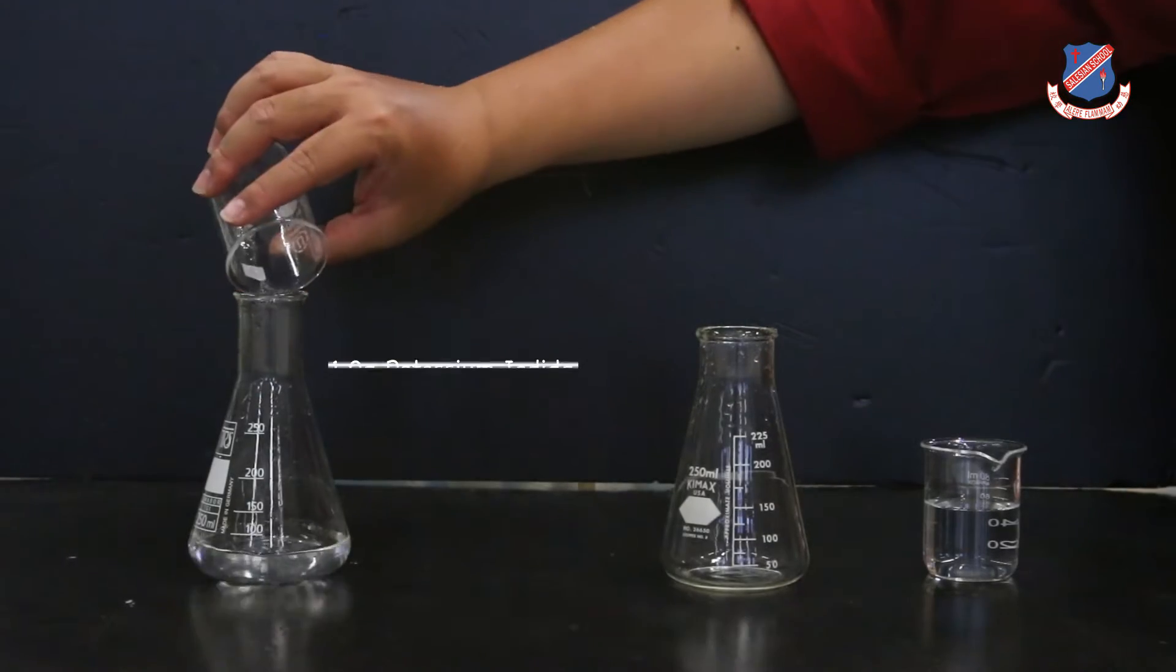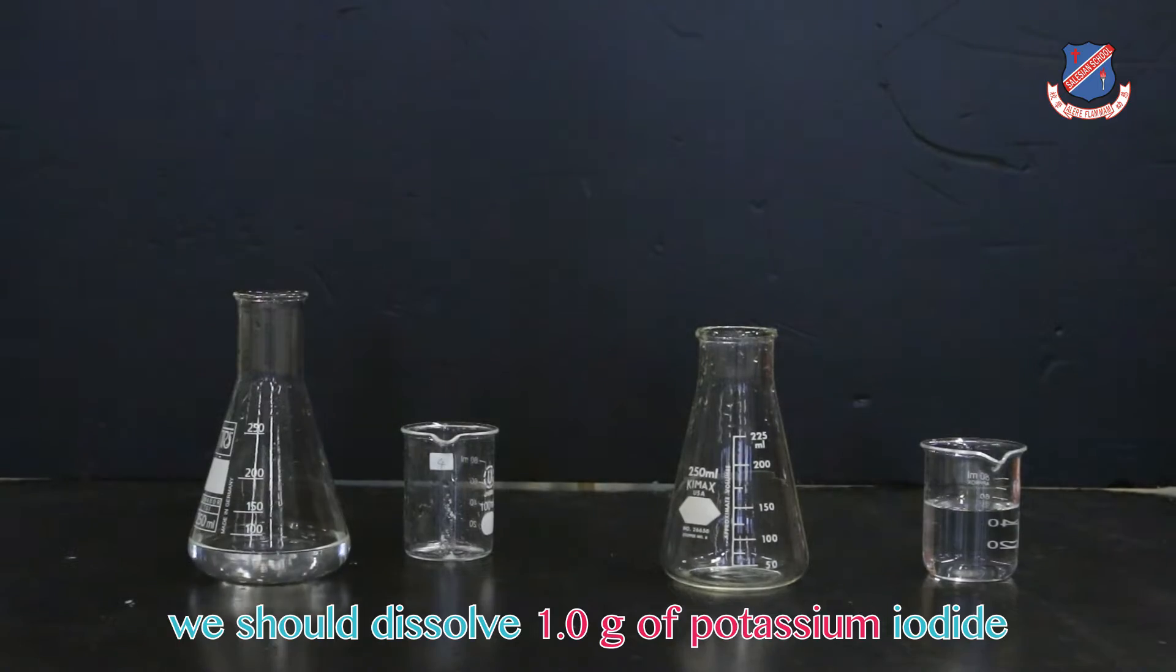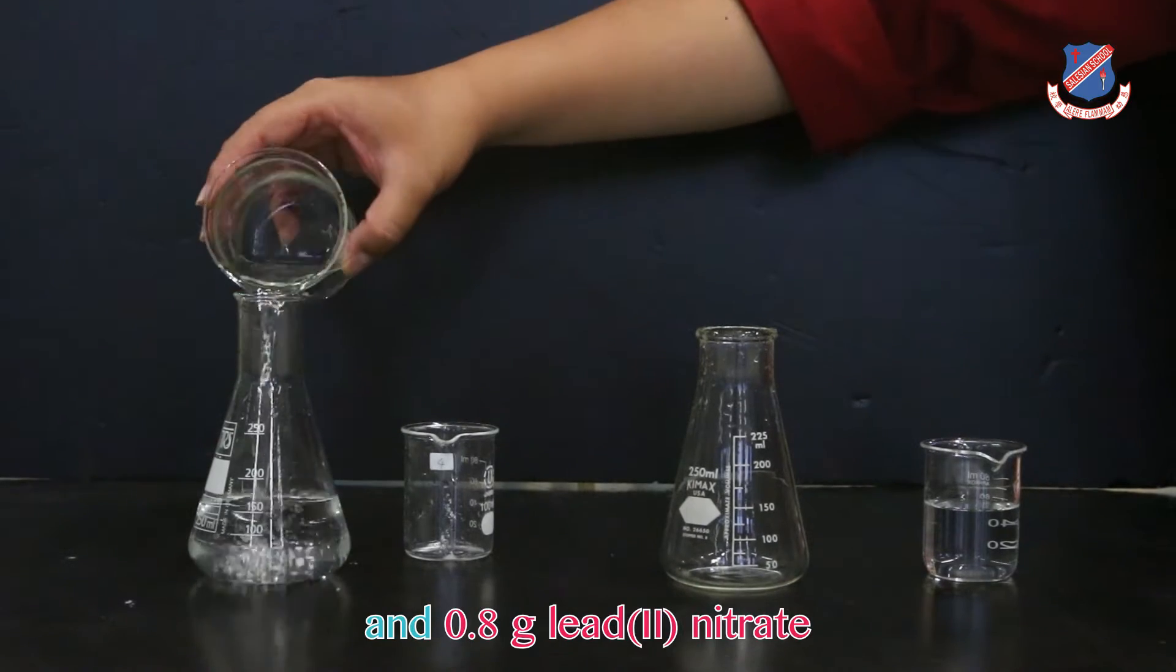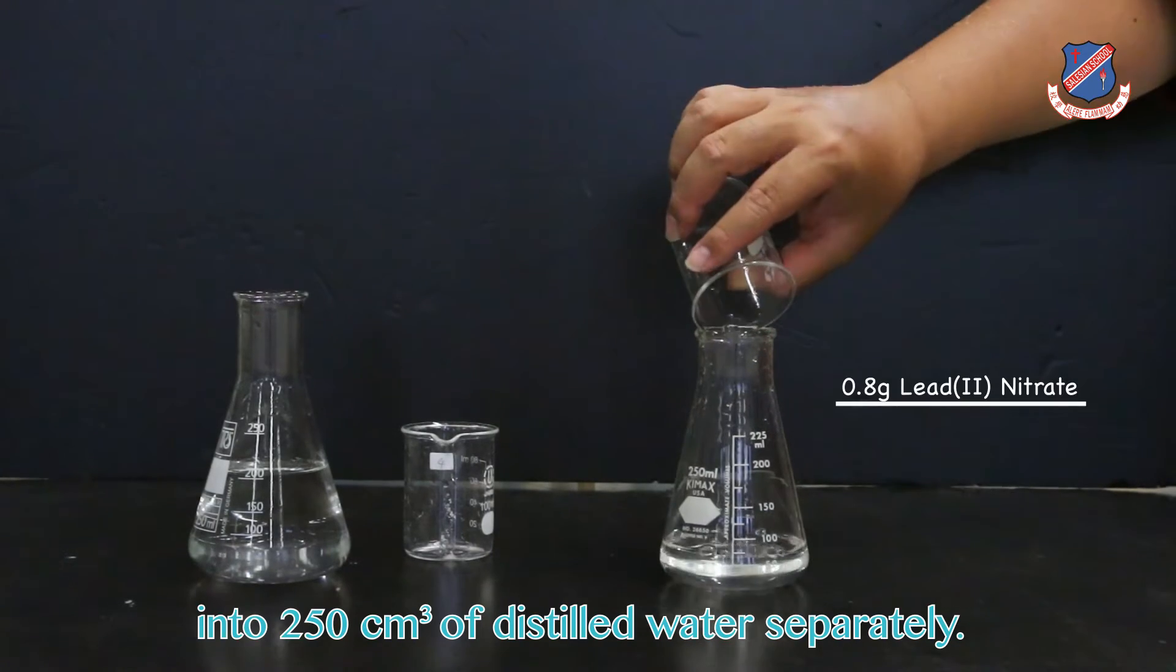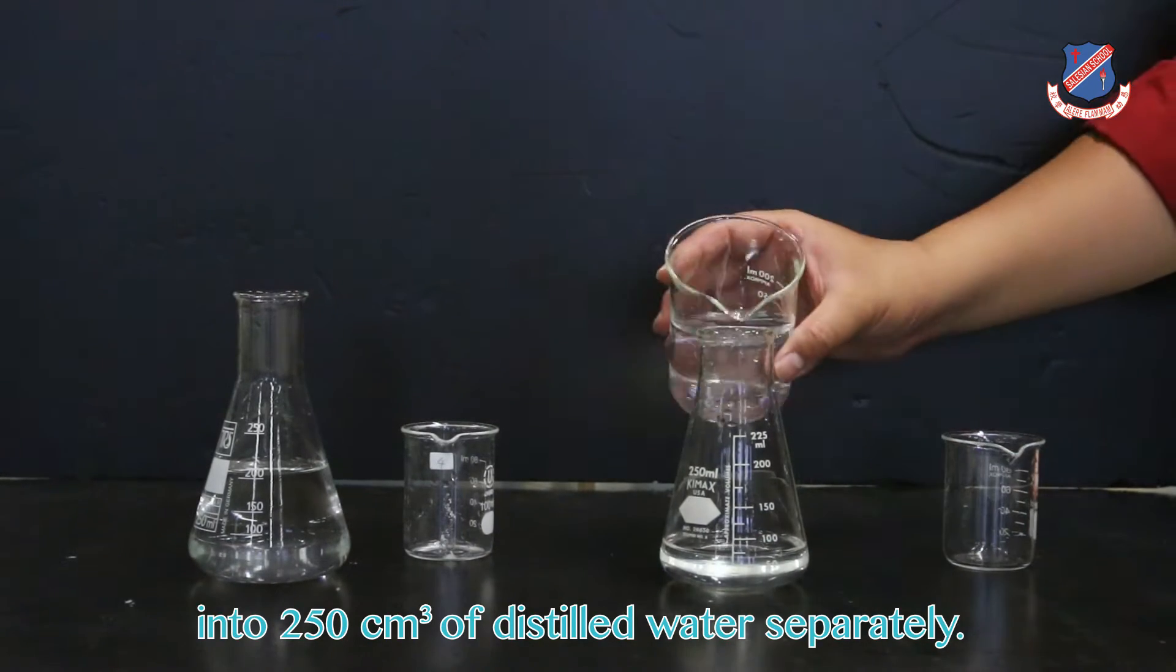To begin with, we should dissolve 1 gram of potassium iodide and 0.8 gram lead(II) nitrate into 250 cm³ of distilled water separately.